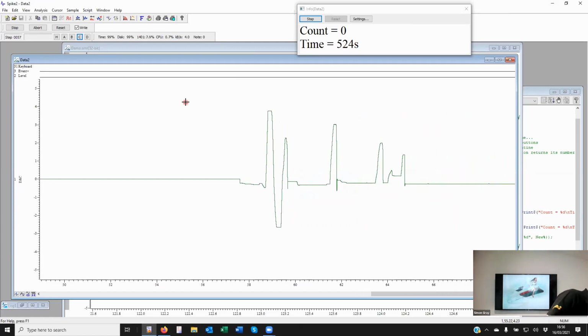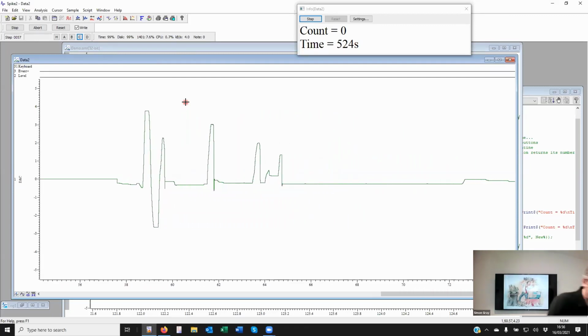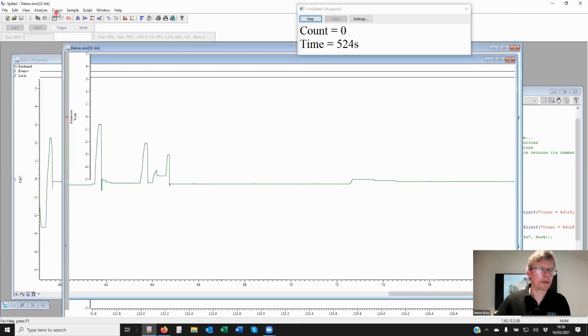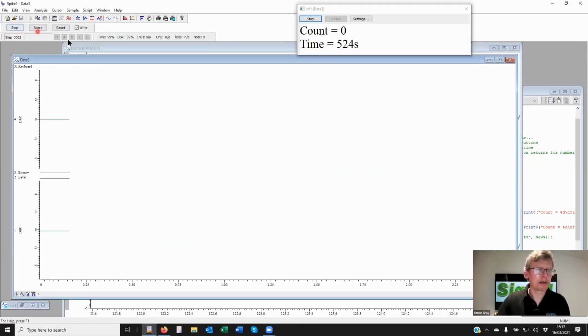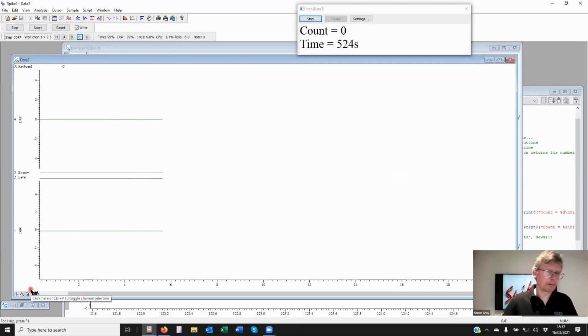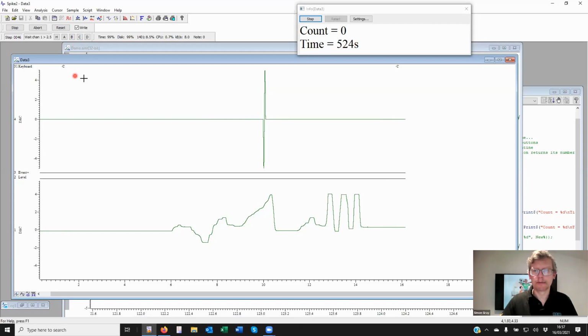Now we need a way of seeing it. So I'm just going to port that and add in another channel. So the waveform, just duplicate that. One now, start, C. We're in the detection cycle. Waveform goes above. There we go. And that's not going to happen again until we fire off C.